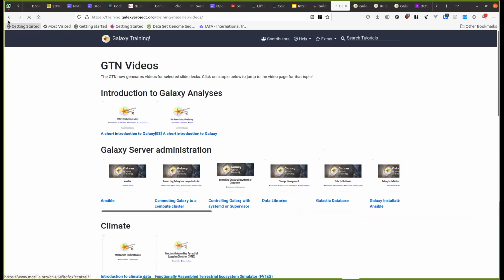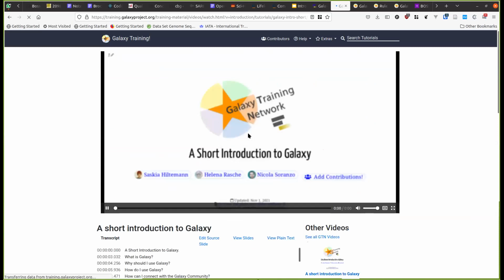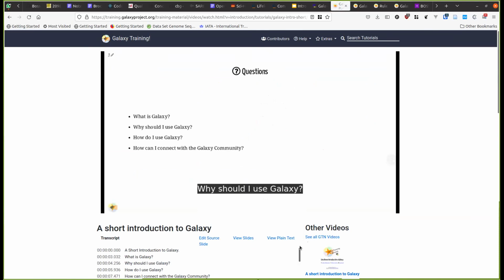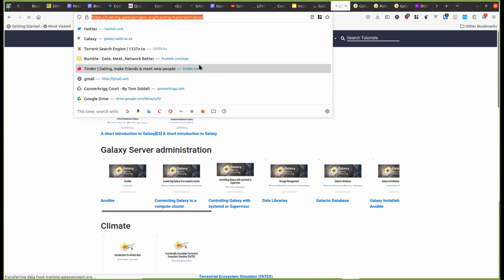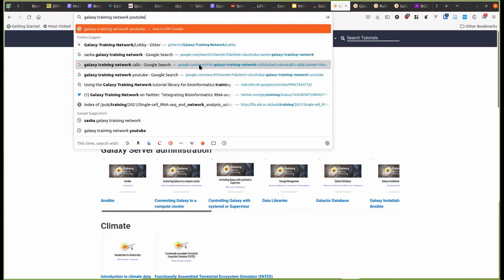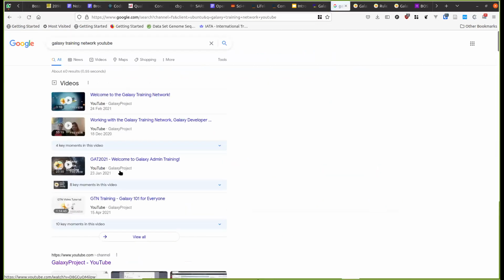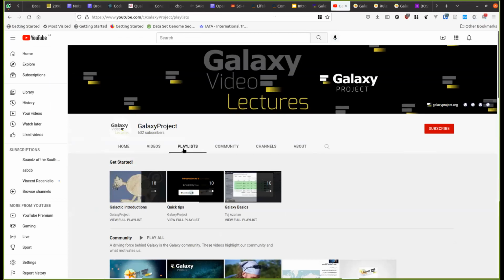So there are some auto-generated videos that have a robot voice, like this one is an auto-generated video, and it sounds a bit weird. But I will also share this link. Let me just find the Galaxy Training Network YouTube. Quite a few of these videos are available on YouTube.